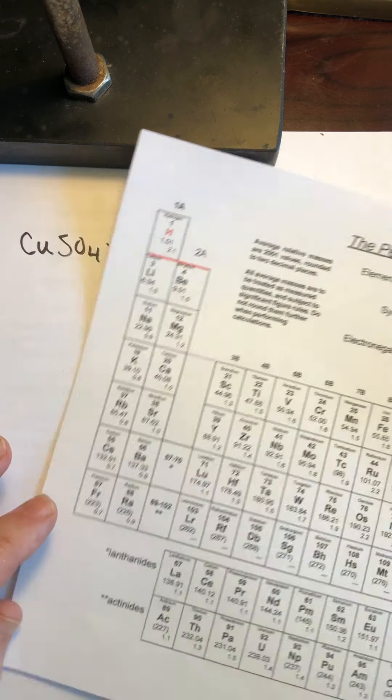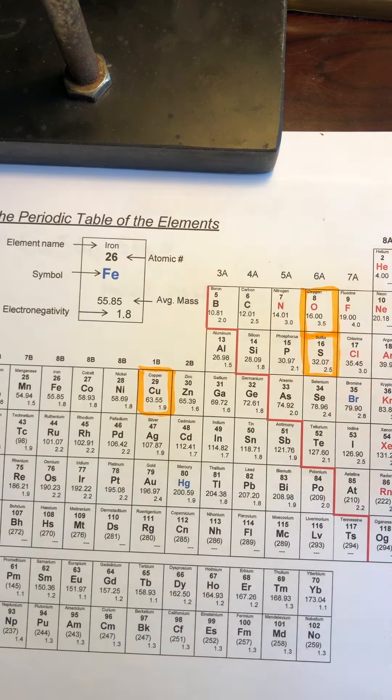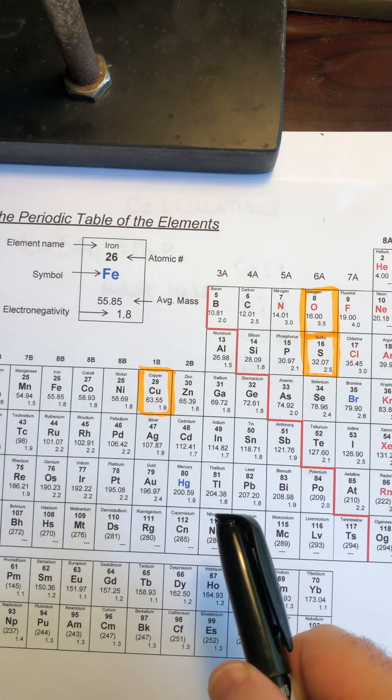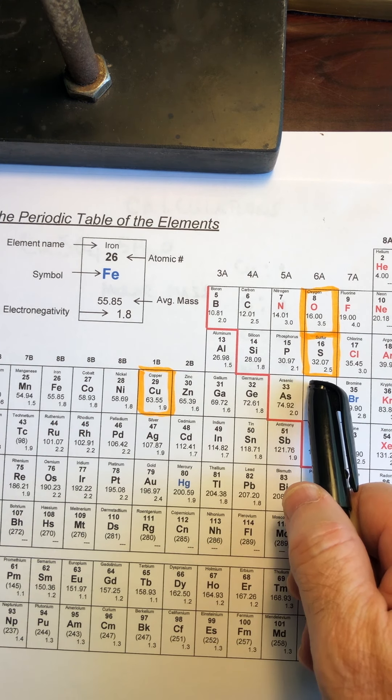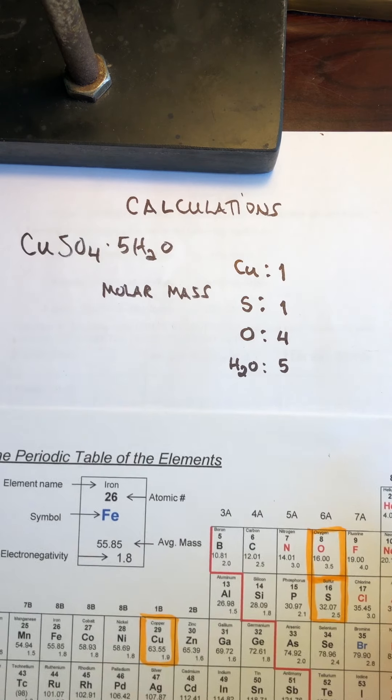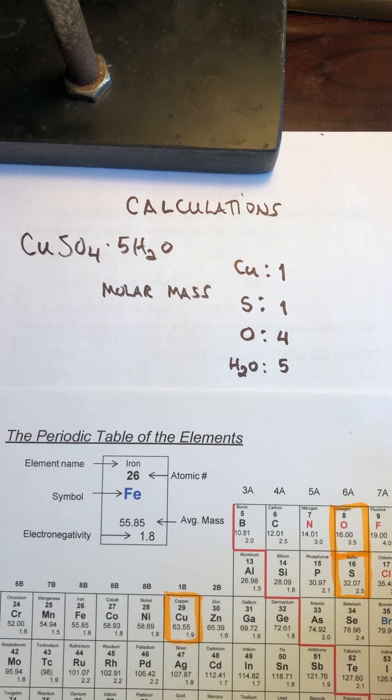We have to go to our periodic table, and I've taken the liberty here of highlighting the copper, the oxygen, and the sulfur, so we can get those numbers very quickly. Let me roll it down a little bit here.